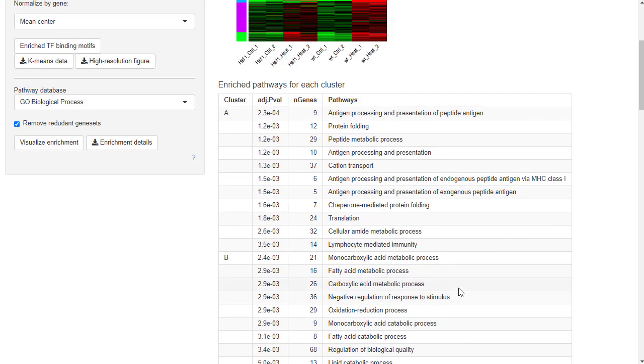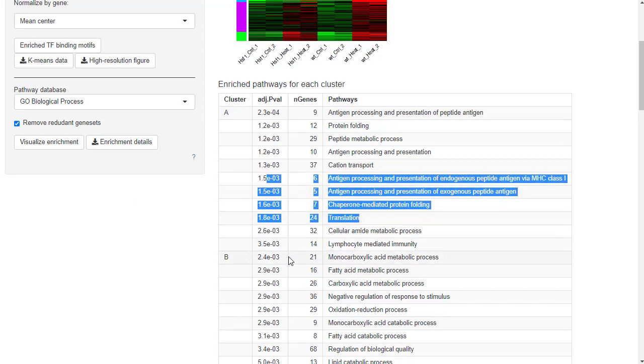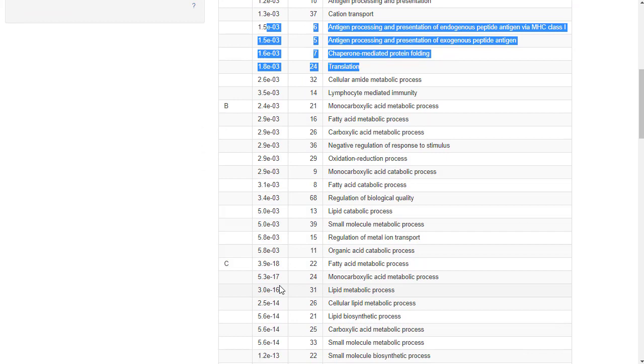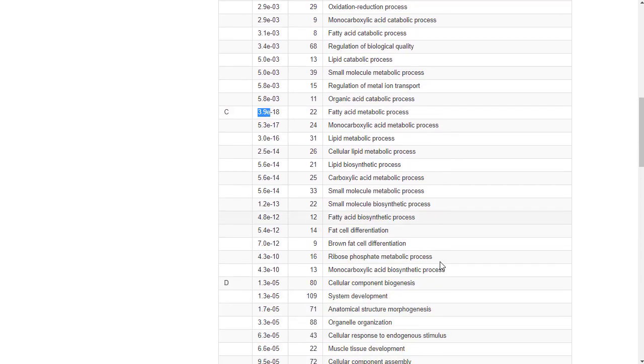For gene ontology, GO BP, there are over 6,000 terms, so a lot of these are mostly noise. So don't try to make a story out of these by ignoring extremely significant results like this. So let's start from here.